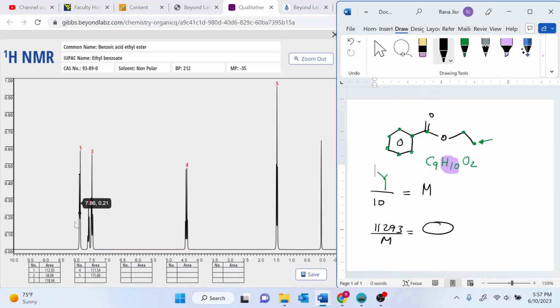for that particular peak. So you're gonna see here from the way that I see it, since I do have proton A in here, this is proton A, this is proton A prime, this is proton B, and proton B prime, and the proton C. I know that benzene here has 3 different types of hydrogens: proton A, proton B, and the proton C. And these are the three different types of hydrogens between 7.5 and 8 parts per million.